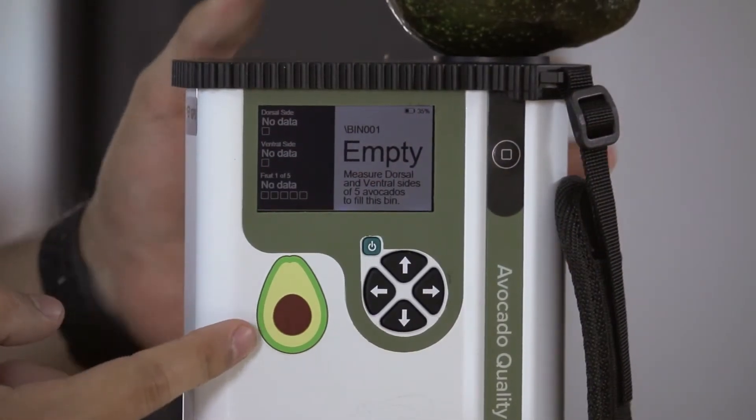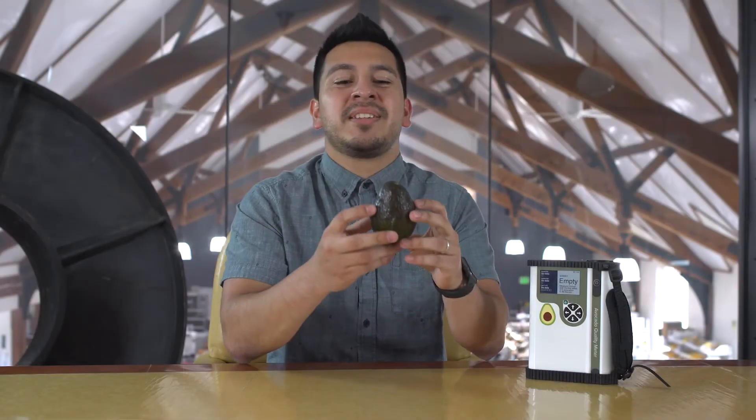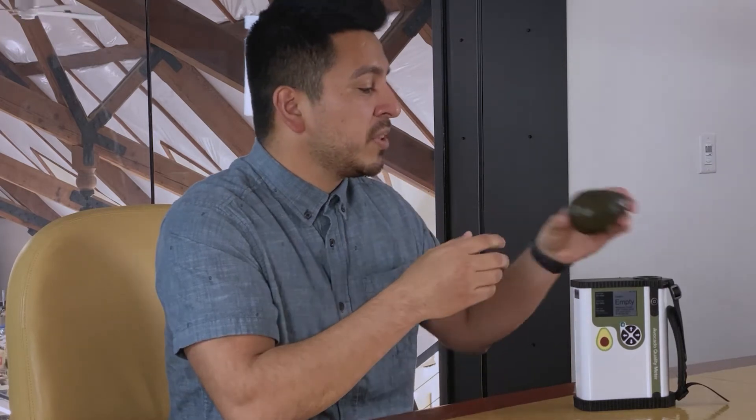Now let's talk about the instrument. Upon powering on the instrument, you will notice the new display interface. I will now demonstrate a measurement of an avocado, but first I would like to discuss how and where to take a measurement. Ideally, the avocado will cover the majority of the lens. This is to avoid any extraneous light during the measurement.